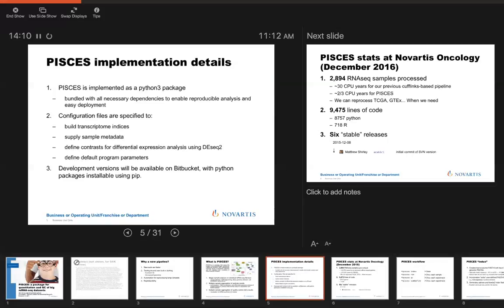What QC metrics are you using? QC metrics, okay, great. At the end of the slides, I have acknowledgements. There was another guy, Jason Merkin, who was working on this with me initially. He came up with this really great idea to use Salmon itself to do some QC. So Salmon ultimately is just counting something like sequence k-mers. And so if you give Salmon a sequence index that contains a downsampled percentage of intronic sequence and ribosomal RNA, mitochondrial sequence, and viral sequence, then you can actually quantify those elements in your sequencing library. And instead of getting transcript isoform or gene level quantification, you're actually quantifying the things that you don't want in your library, right? So we tried using Salmon itself with a special index built with all these QC elements to generate its own QC metrics. And I think that we could have further developed that approach.